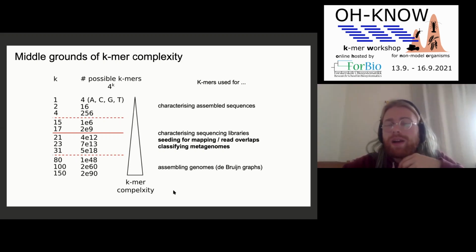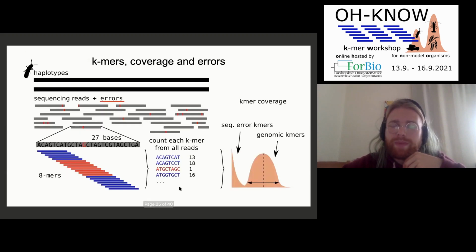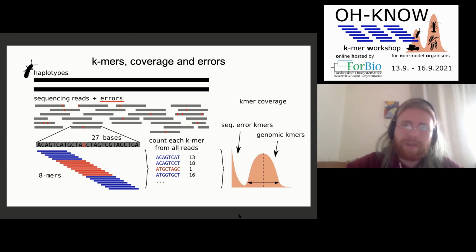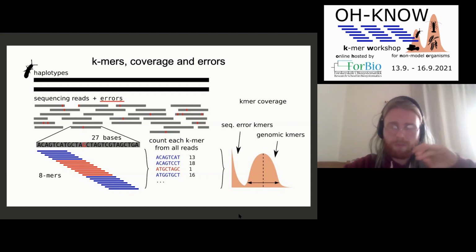Yeah, so I was thinking about it a lot. In theory, if you would have an infinite amount of coverage, even with Oxford Nanopore, you would get a separation of what is real and what is not. Because the probability of the error is still random, and it will always generate more likely the real genomic Kmer than an error of a certain kind. But it becomes a lot more sneaky. Kmer methods are powerful for sequencing technologies that have a low error rate.